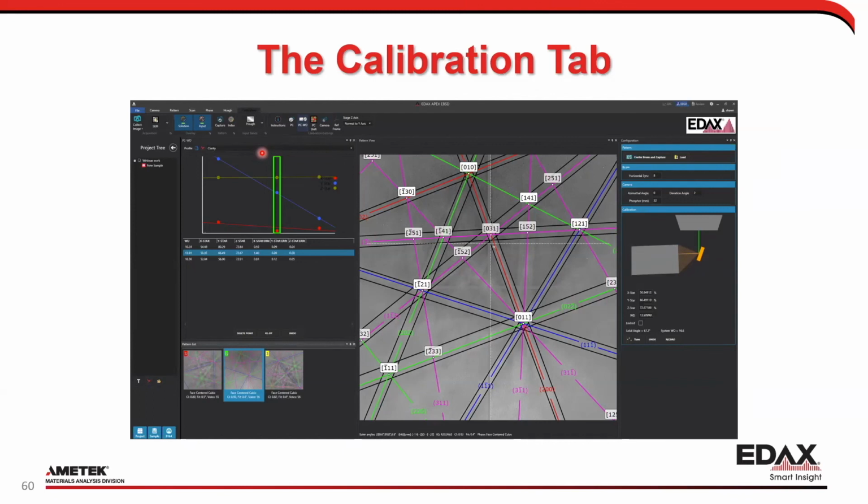The other thing you could do in this case is make a TKD specific calibration profile. Usually we use this optimal operating range for, let's say, 8 working distance down to like 20 or something for your calibration profiles. For TKD, you're often at much lower working distances that may not be covered by your typical calibration. So you can make your own calibration file just for TKD from, let's say, 3 millimeters to 7 or 8. And then you have a much more well-defined calibration profile for those lower working distances to do things like TKD work.